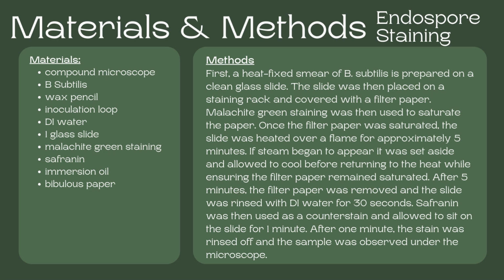After 5 minutes, the filter paper was removed and the slide was rinsed with deionized water for 30 seconds. Safranin was then used as a counterstain and allowed to sit on the slide for 1 minute. After 1 minute passed, the stain was rinsed off and the sample was observed under the microscope.